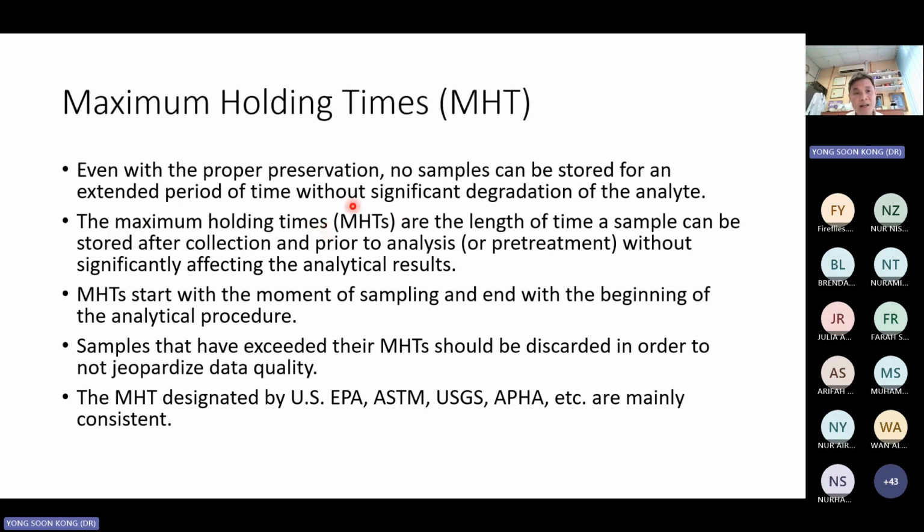Because these are the keywords that always pop up whenever we collect samples for analysis. So whenever you have an environmental sample for analysis, this is the most important thing you have to determine. That is the length of time the sample can be stored after collection until it is analyzed. So that is a time frame.